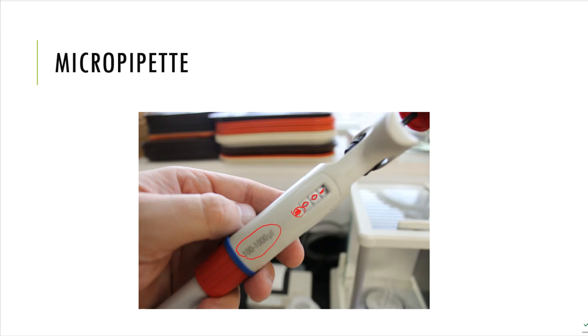It says 100 on here, but that 4th digit is somewhat hidden to you right now, and there's small little tick marks down here at the very bottom. That is our 4th digit that we need, okay? Now, if I need to dial 800, then that means this needs to say 080, and the little tick marks down here at the bottom would also say 0. There is my 800, or 0.8 milliliter.